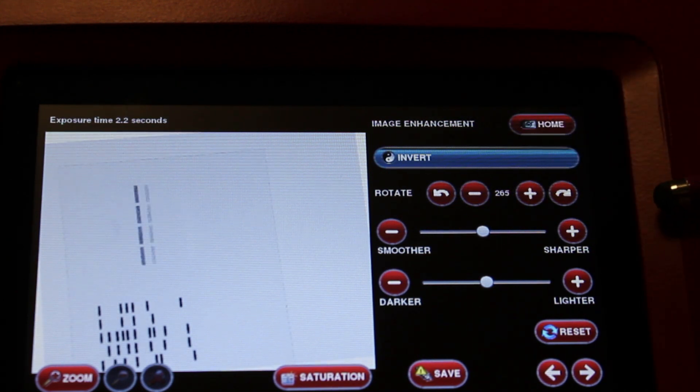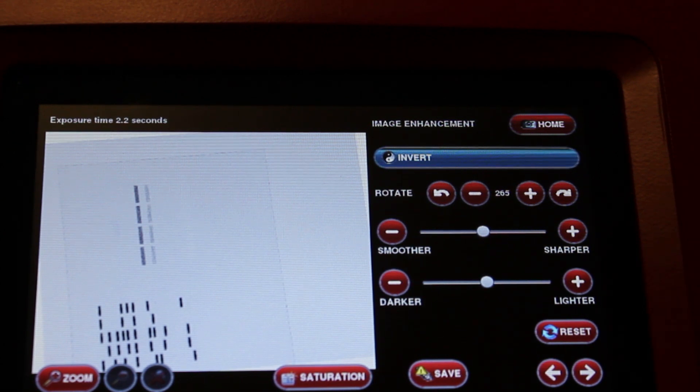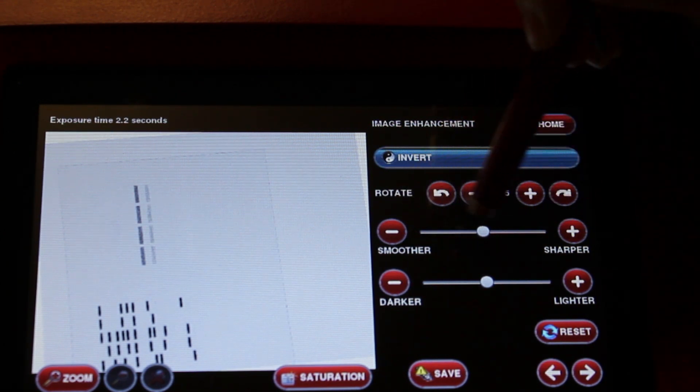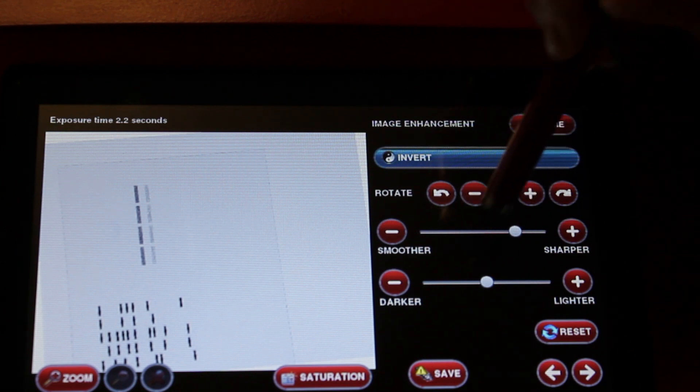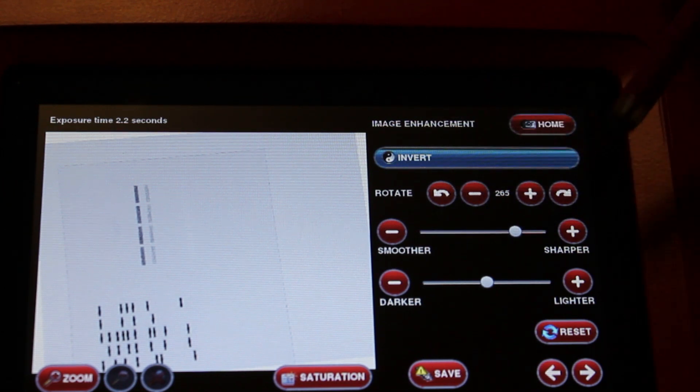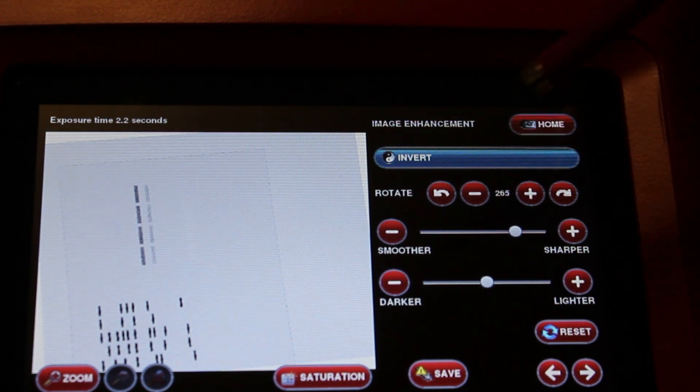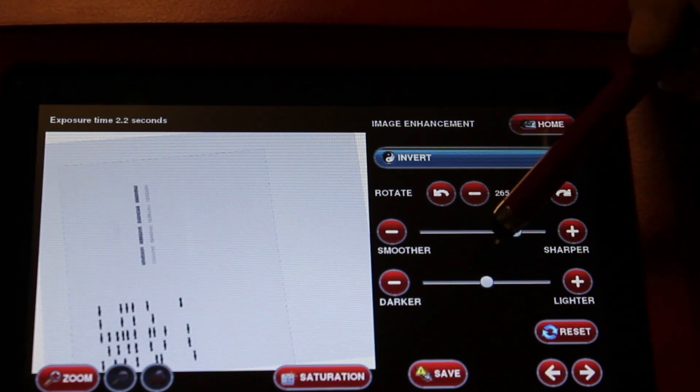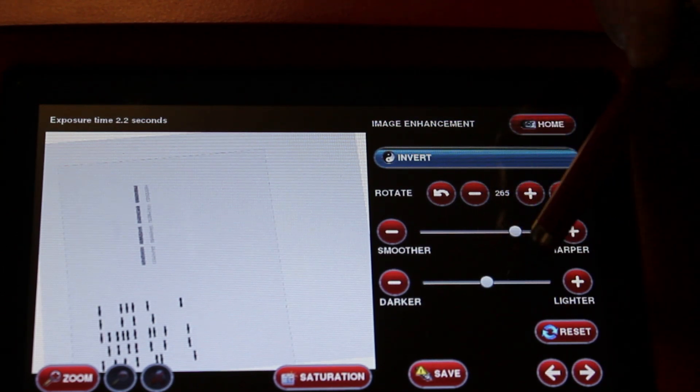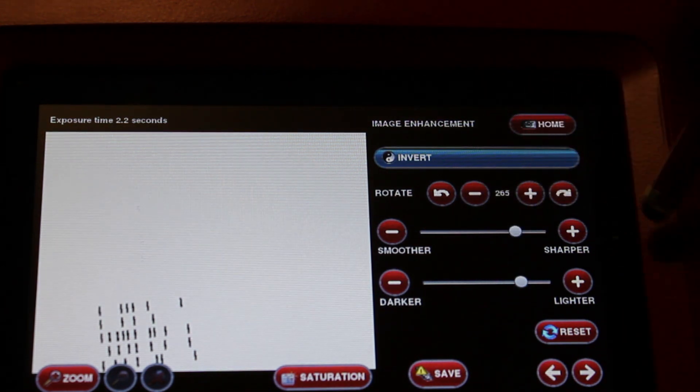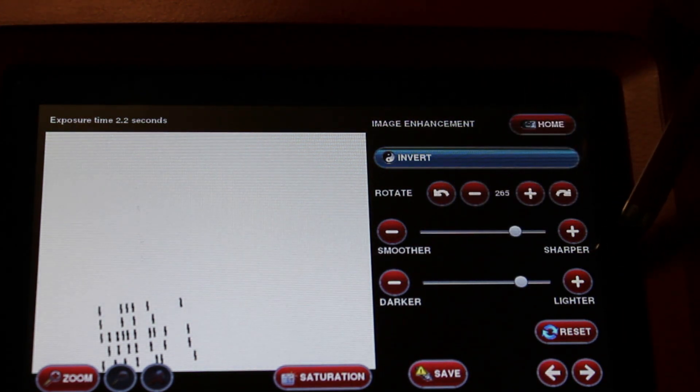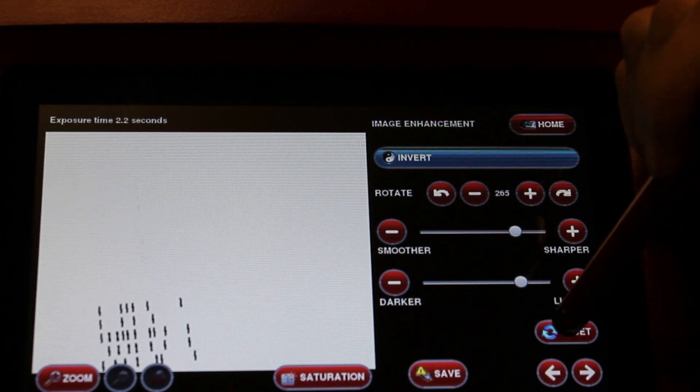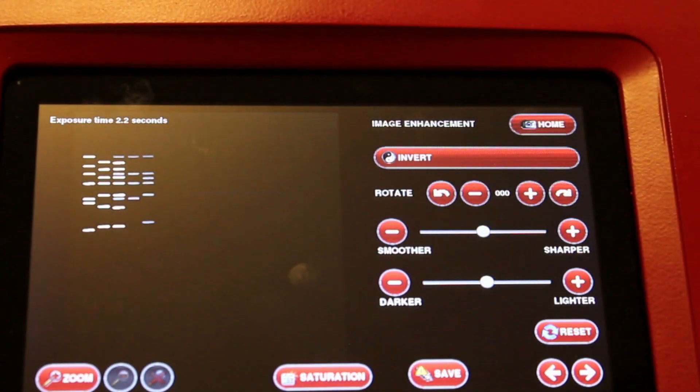You can also smooth or sharpen the image. You can move the slider bar or use the plus and minus for minor adjustments. We also have a brightness contrast slider bar. You can move the slider bar to make it lighter or darker, or use the plus and minus buttons. You can always reset using the reset button.